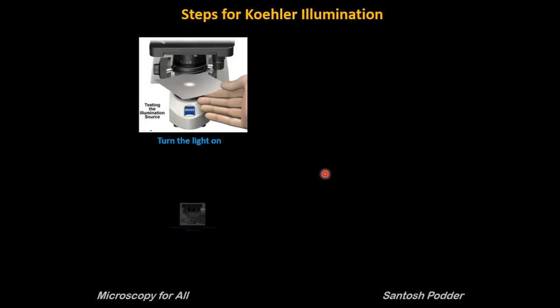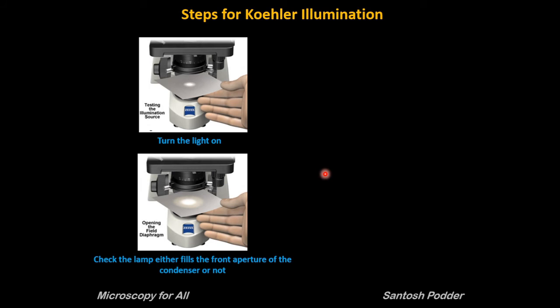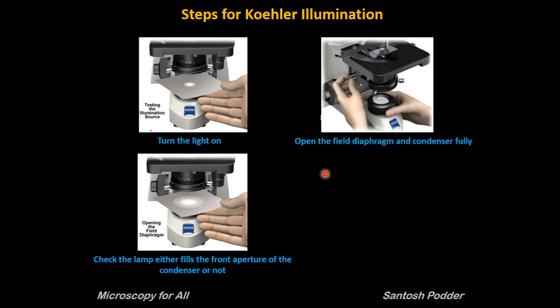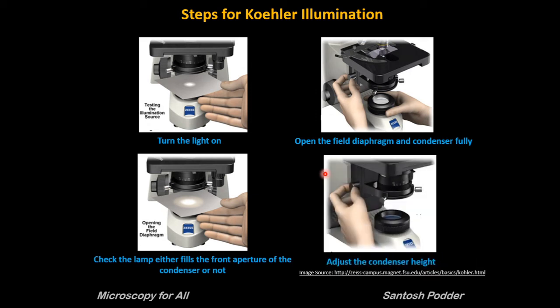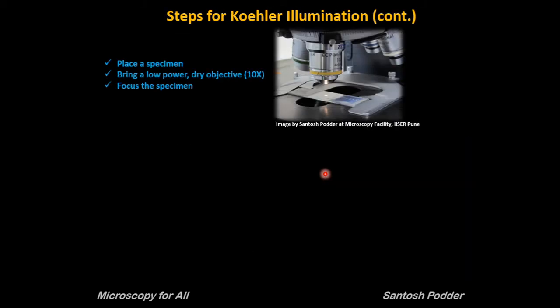We will now learn how to correctly set the microscope for Köhler illumination in a few simple steps. First, turn on the light and check the lamp to see whether it fills the front aperture of the condenser — you can use a sheet of paper placed in front of the condenser front aperture to see this. Then open the field diaphragm and condenser fully and adjust the condenser height, bringing the condenser as close as possible to your sample, perhaps within one to two millimeters. Then place a specimen and load a low-power objective, preferably 10x, and focus the specimen using the system's fine and coarse adjustment knobs.